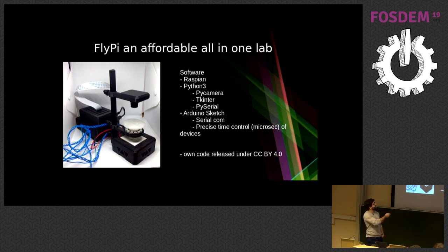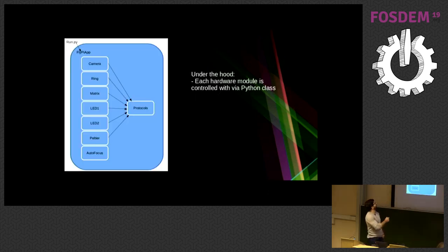So we have an Arduino sketch, obviously, that is just taking care of the serial communication with the Pi, and taking care of the precise timing of things, right? The code that we wrote is released under a Creative Commons BY 4.0 license. And this is a little schematic of how everything works.